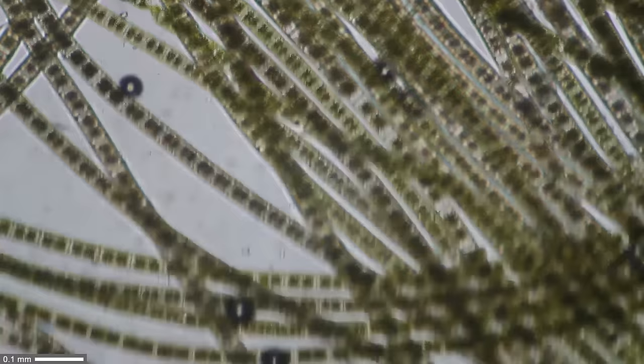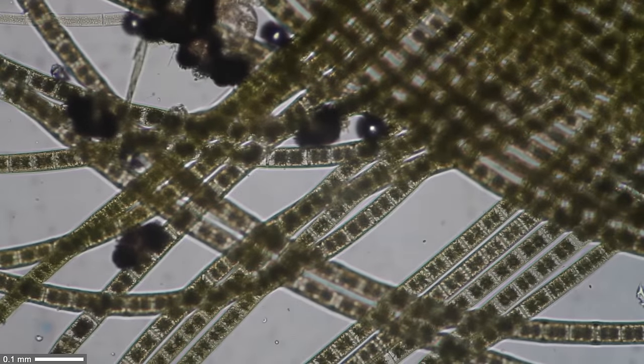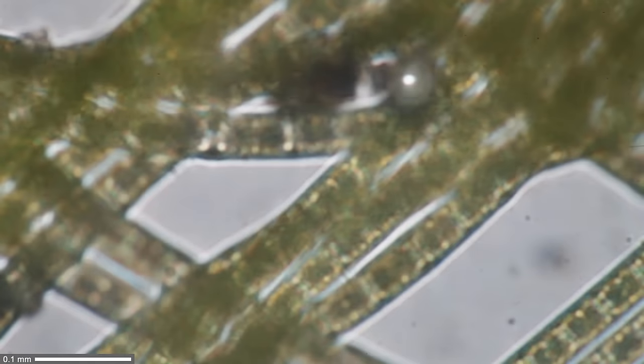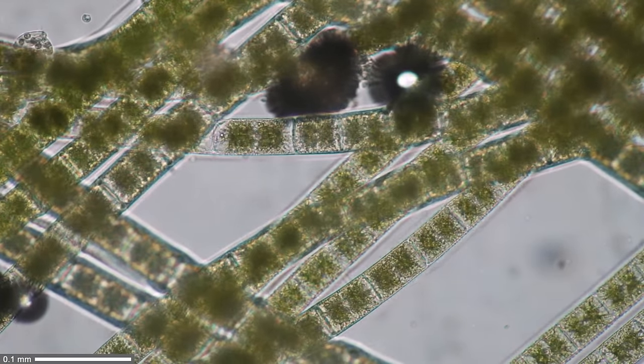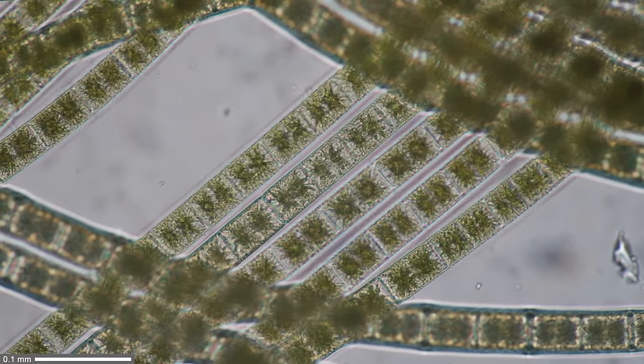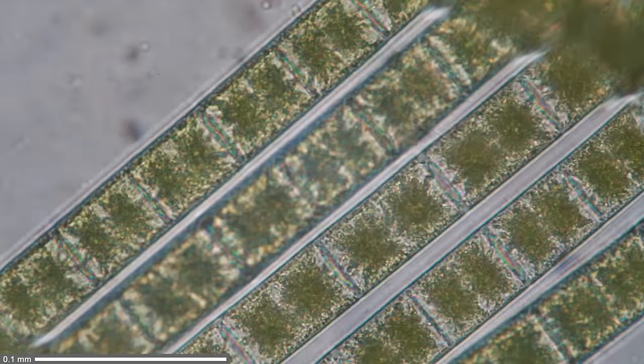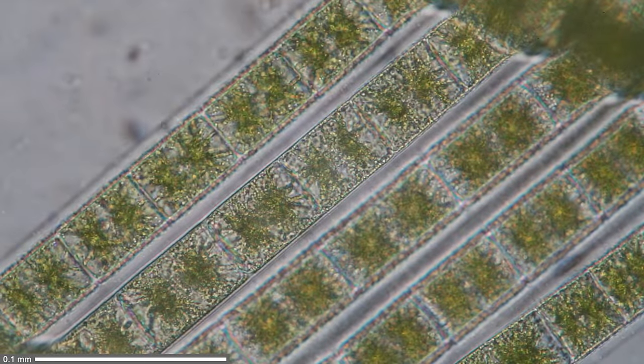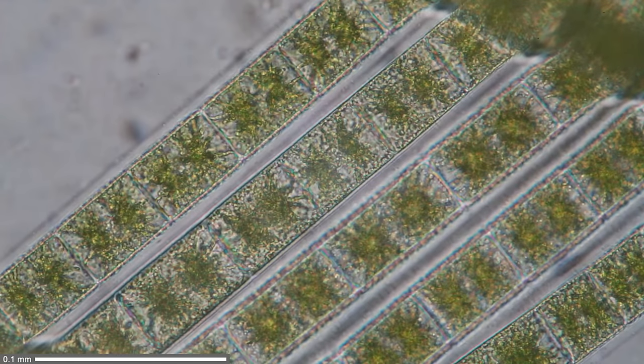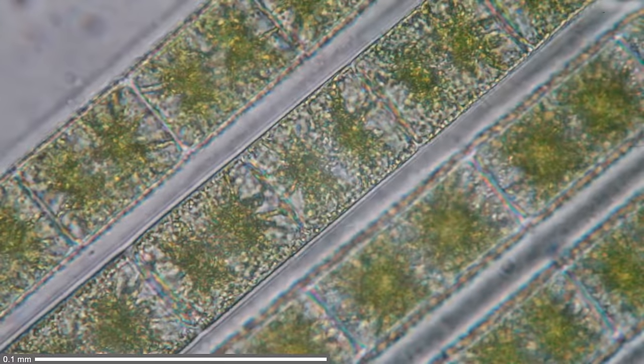You can already see some of the structural details of the cells and the chloroplasts. These are eukaryotes, of course, so they have a nucleus and cell organelles. They are easily observable because they're relatively large. At higher magnification, you can see the scale bar also increases in size. The water sample was not really very interesting because we did not see so much biodiversity. The algae was mostly the same type. You can see the nice regular structure. That's one of the good things about using bright field microscopy—you can see the colors quite well. You can now see the chloroplasts inside the individual cells.